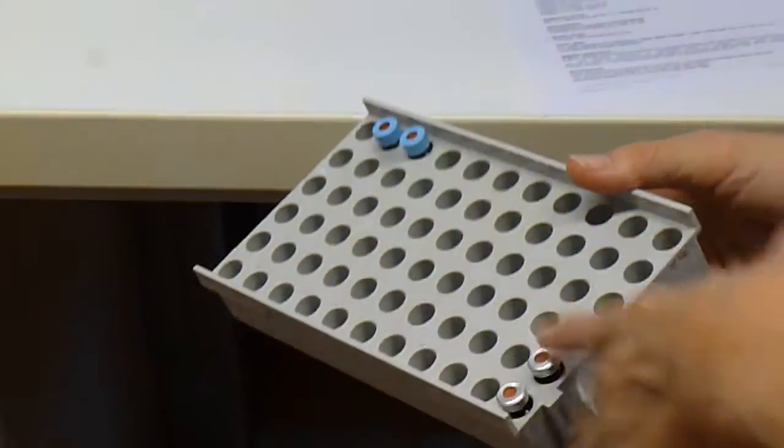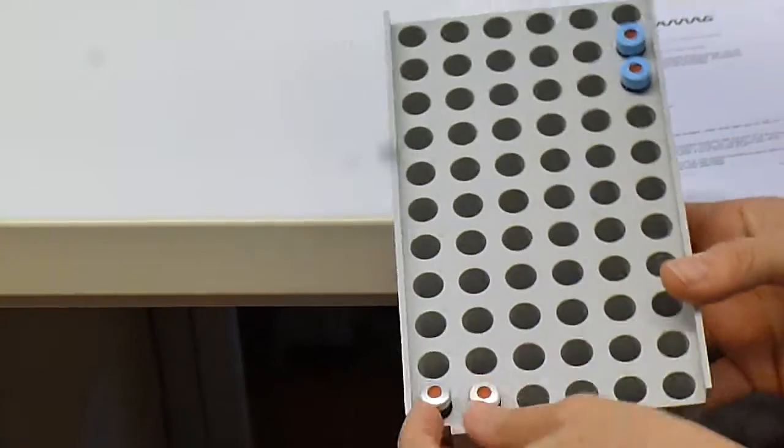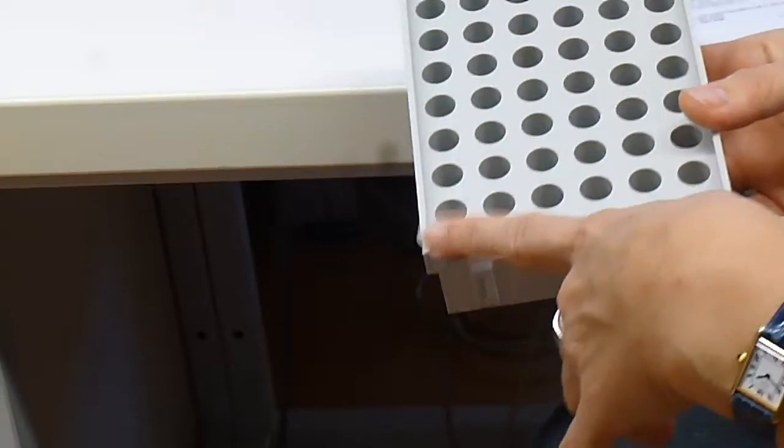I prefer to separate the standards and the samples. So I take for the standards the A position, and for my samples the B or C or D. So I have a better look for it, and I can better separate it.